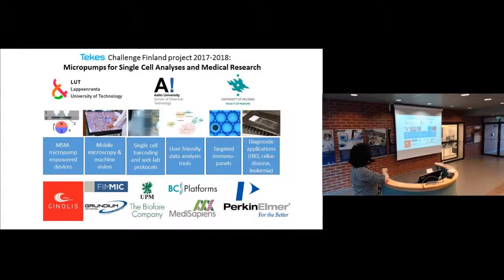So Kari Ulleko's team is building us up here, and we want to replace our expensive dolomite pump systems with these chip integrated micro pumps, which can be so cheap that we can have them as disposable ones integrated into the chips.